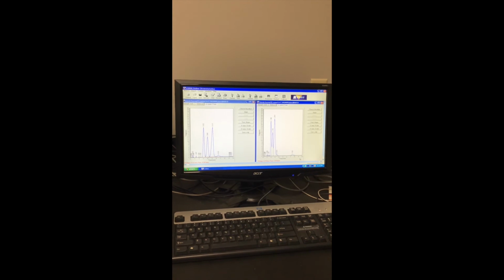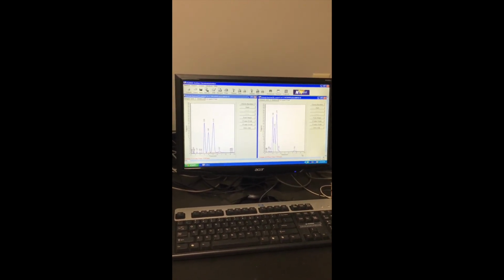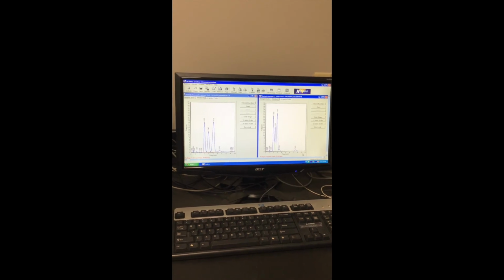You could probably do this tomorrow in actual research if you don't know when this is supposed to be. You'd obviously wait for as long as possible to ensure that everything is passed to the GC, but we can most likely cut it off at 8.5 minutes.